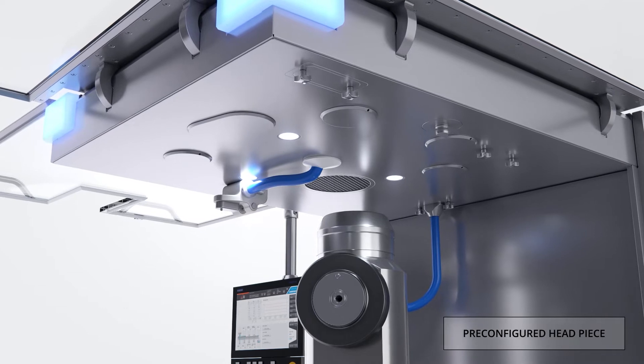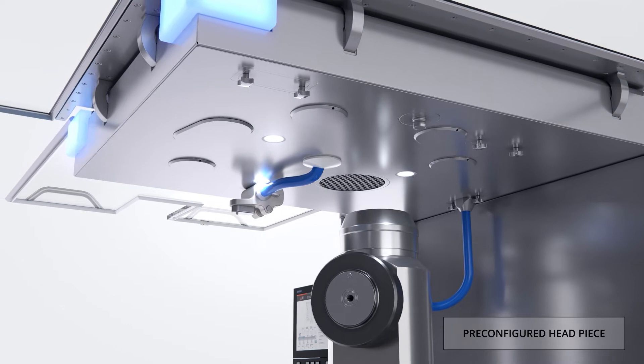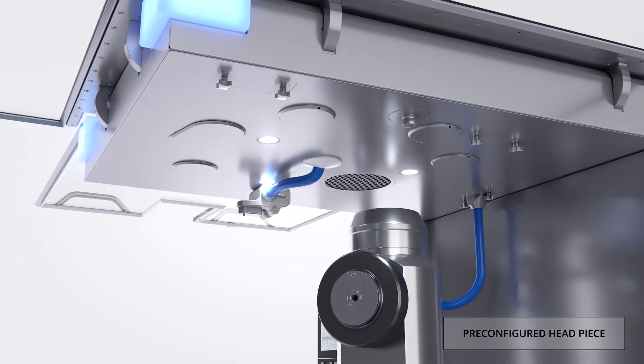The motorized adjustment of the rollers, the position measurement of the rollers, and the instrumentation of the rollers to permit press force display is included in this single connection.